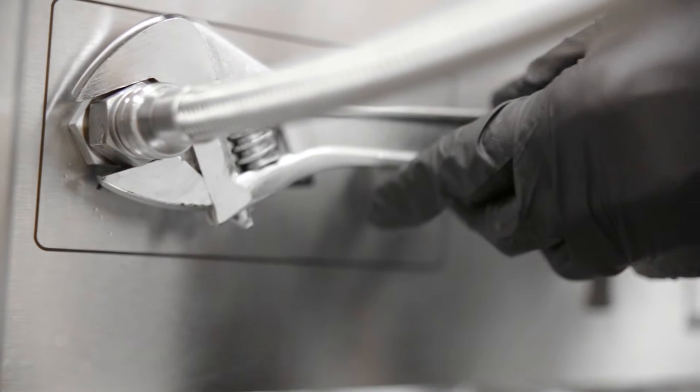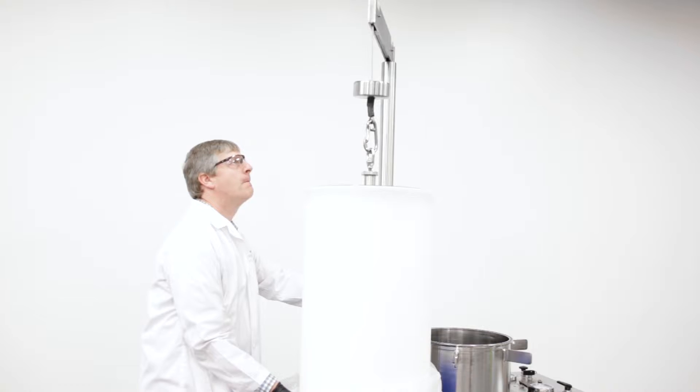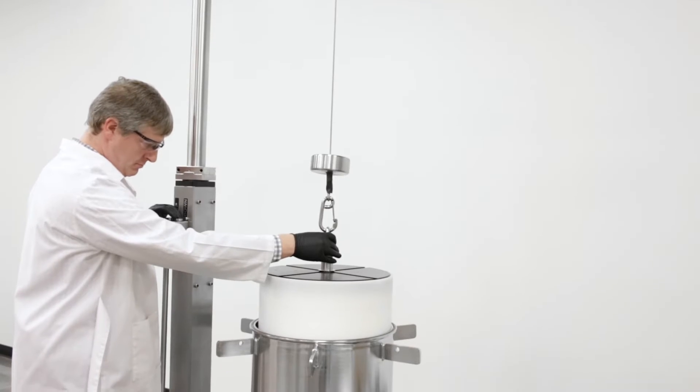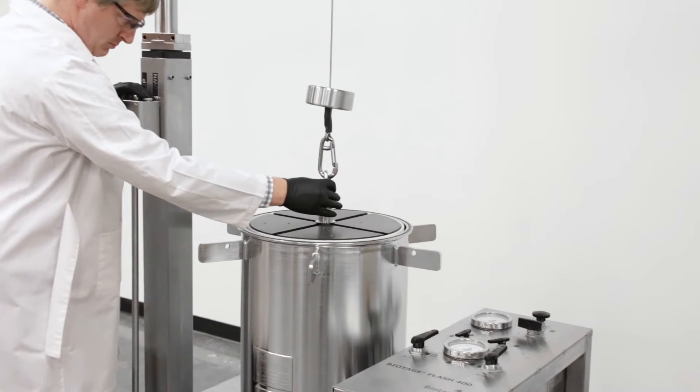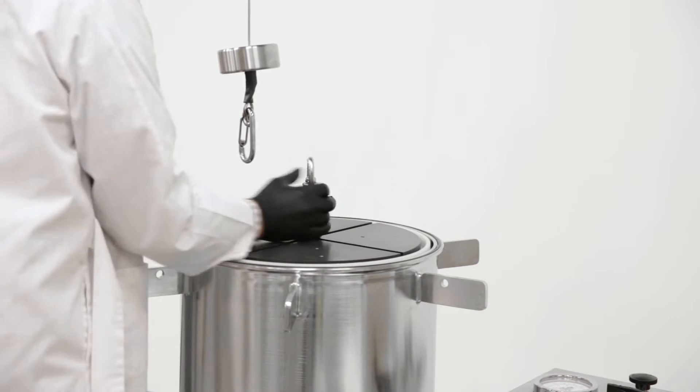The purification cartridge is lifted in place with a built-in pneumatic hoist. A lifting tool is included to securely attach the wire to the cartridge.